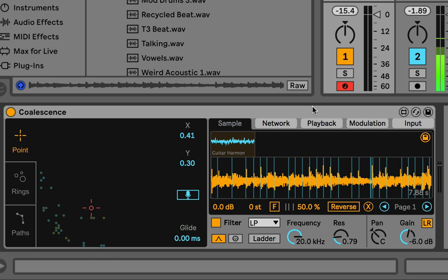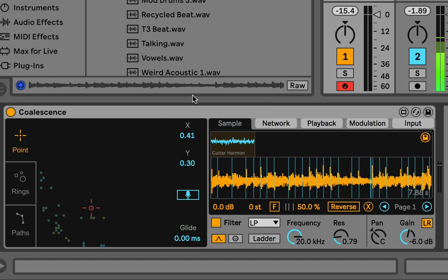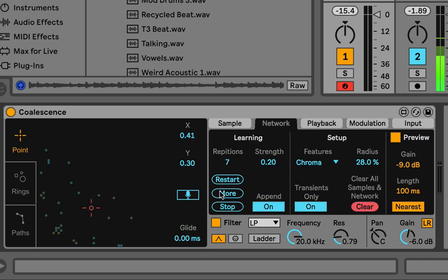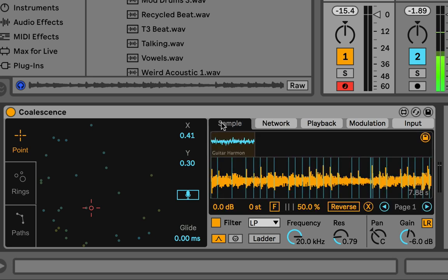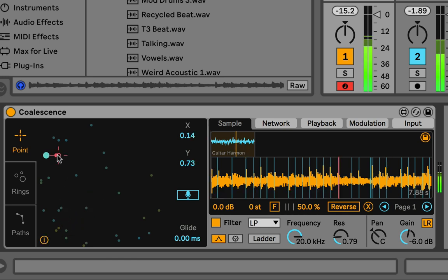Now let's talk about the network and how the samples go into it. This is an SOM neural network. What it does is group or cluster data points, and those data points are the different slices of the sample, visualized in this circle.